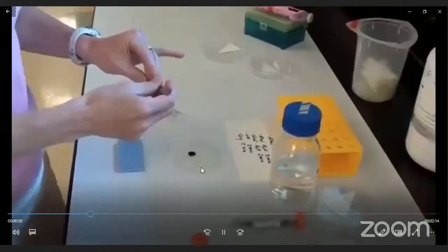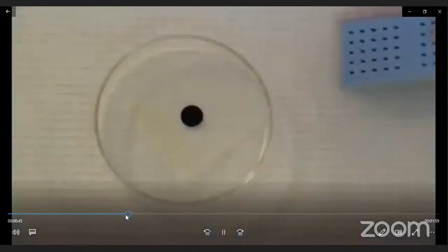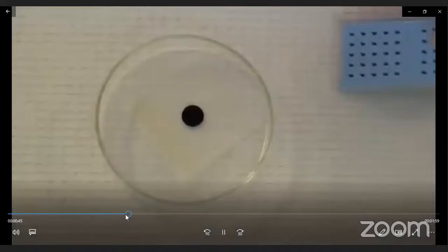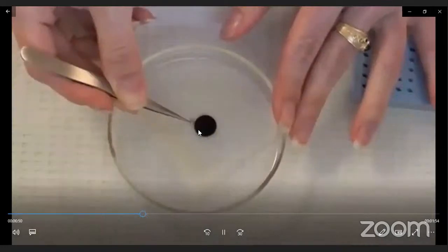I'm just skipping this part. The grid is now being placed over a carbon tape, so that the grid sticks to it, because this grid is so light that even your breathing is enough to blow it off. So we have to handle the grid very carefully.